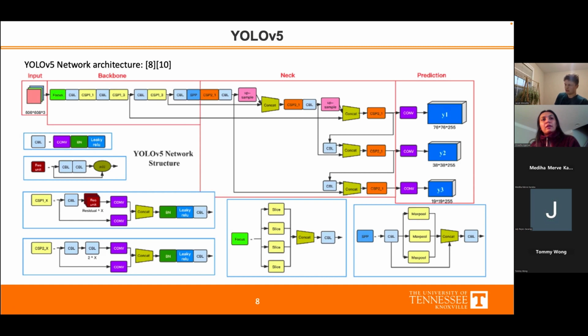Right. If you remember in class, we did a very similar problem where we had something called feature extraction. So the backbone is basically extracting the features. That simply means if you provide an image, of various voids, it would convert that image into a low resolution image. The entire big void is compressed into 3 pixels so that it's easy to process, because continuously this is happening in the backbone. So the backbone is actually doing the feature extraction job.